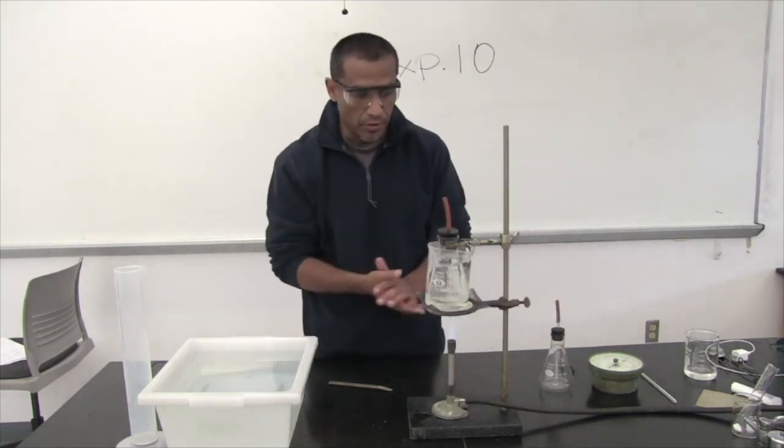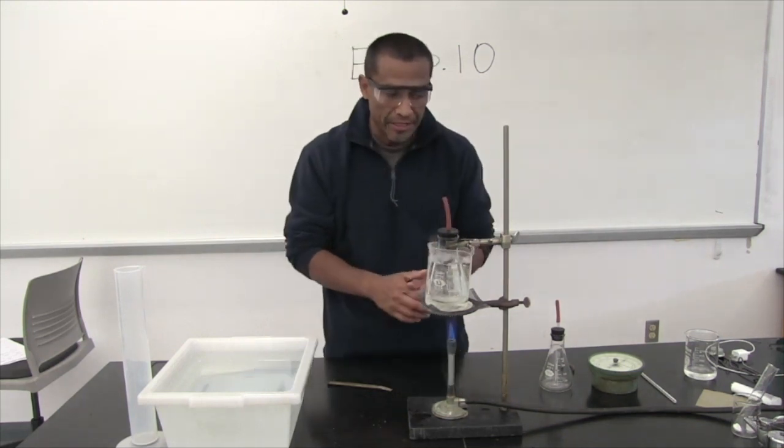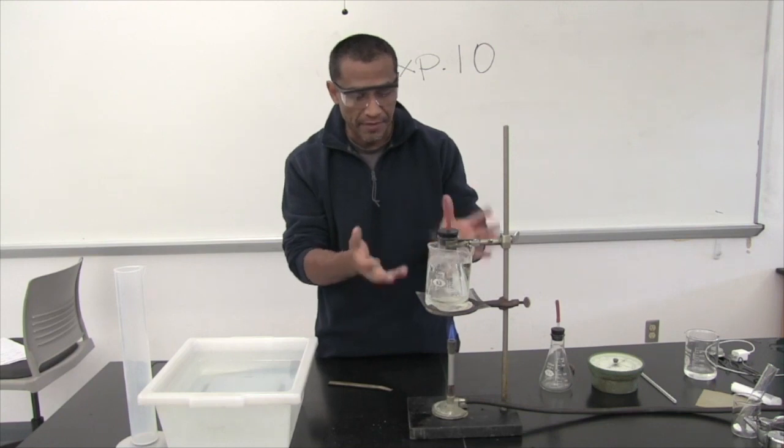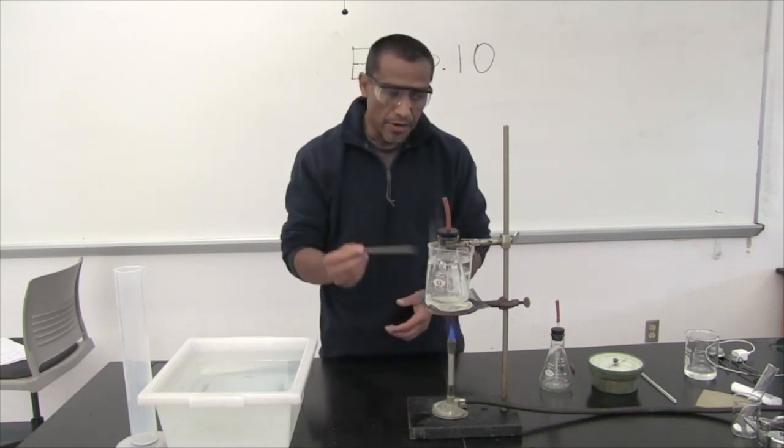Most of it is submerged under boiling water. It's been sitting there for over 5 minutes. So we're going to assume the temperature of the water equals the temperature of the air inside the flask. And notice it's still open.